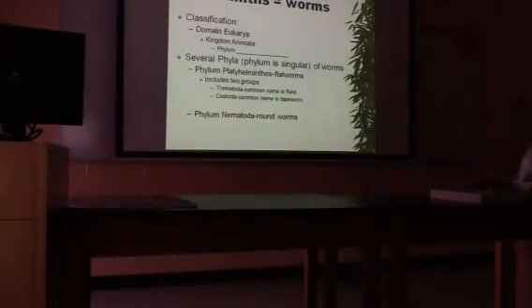Question? How do you identify Cestoda? Yeah. Scolex and proglottids. They have this body shape. That's the first one I look for. Does it have a head and repeating proglottid segments? Okay.